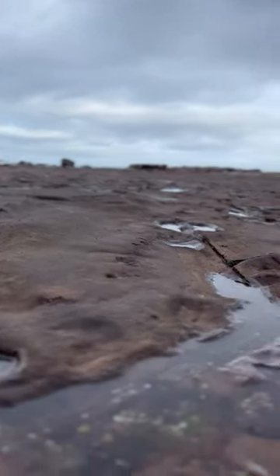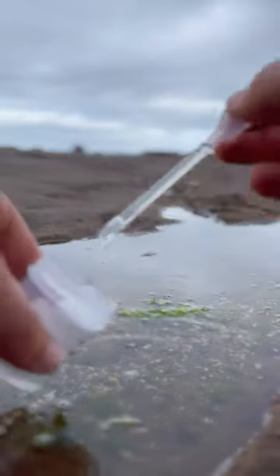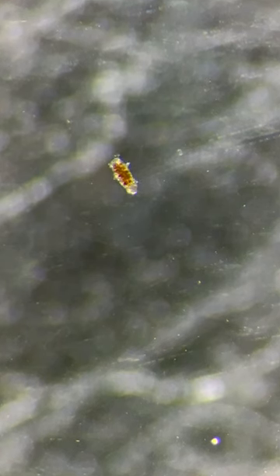The animal that I am about to show you is smaller than the tip of a needle. For the first time on this channel, I am going to show you a marine water bear. There are many different species of water bear. This one is incredibly small. Have a look at this.